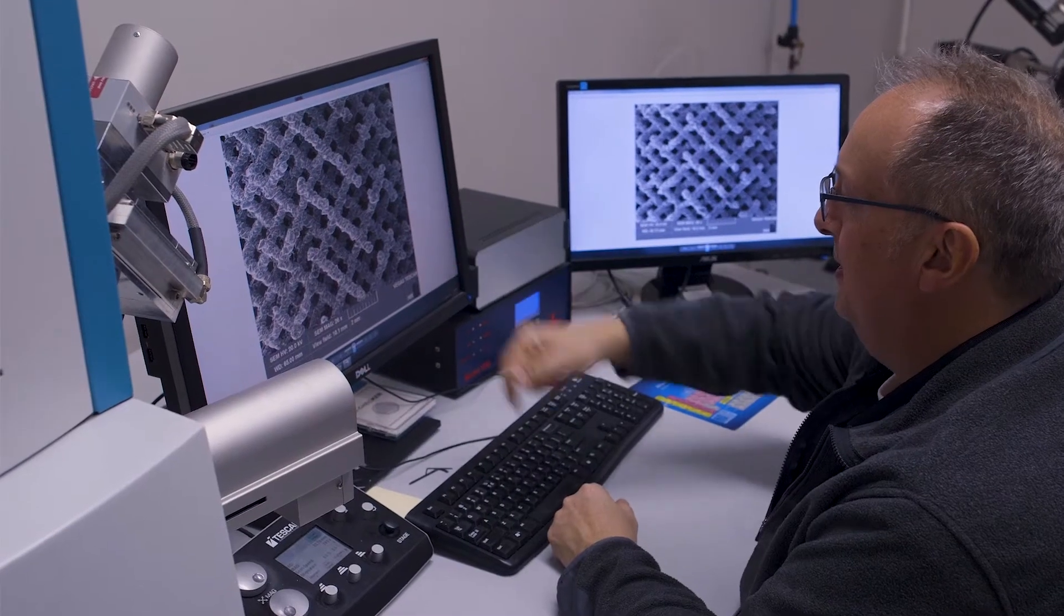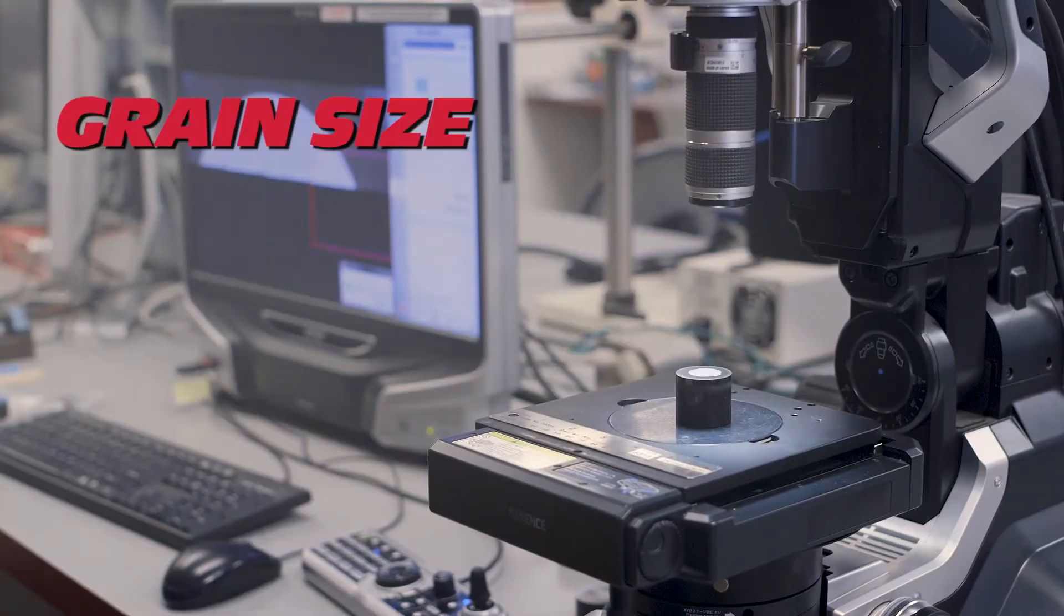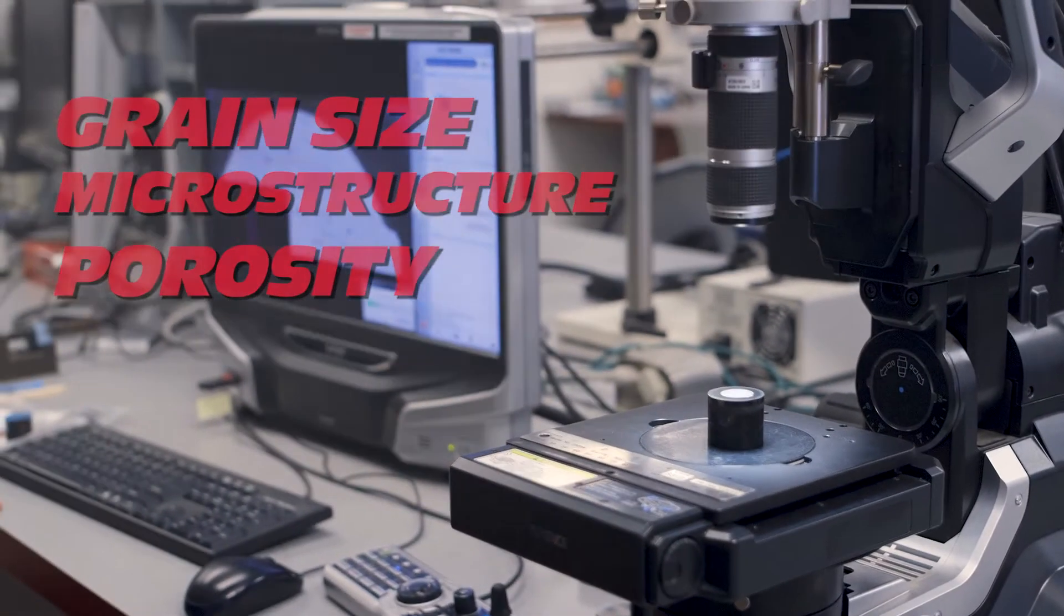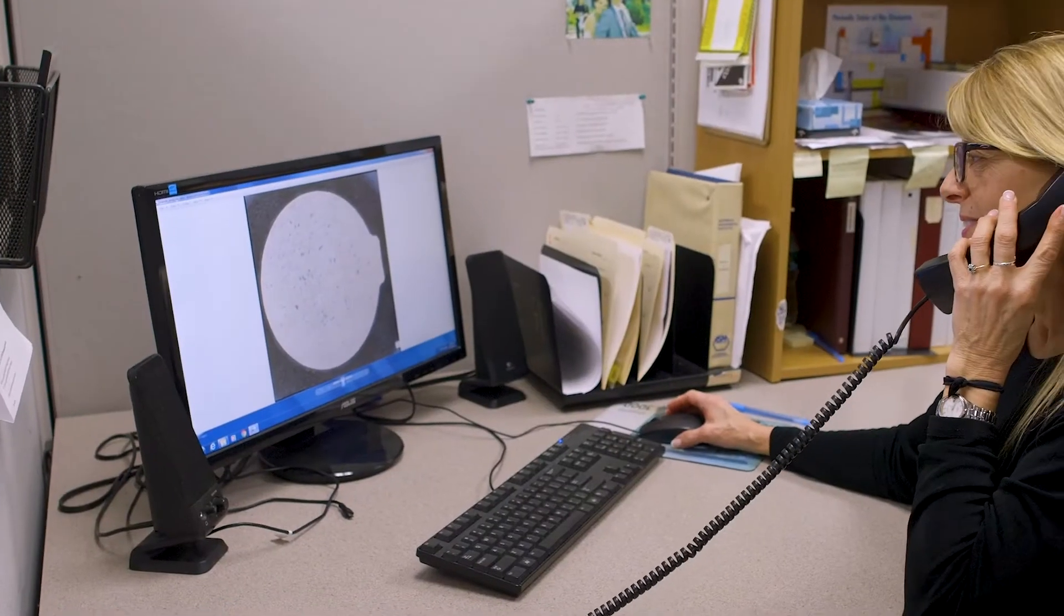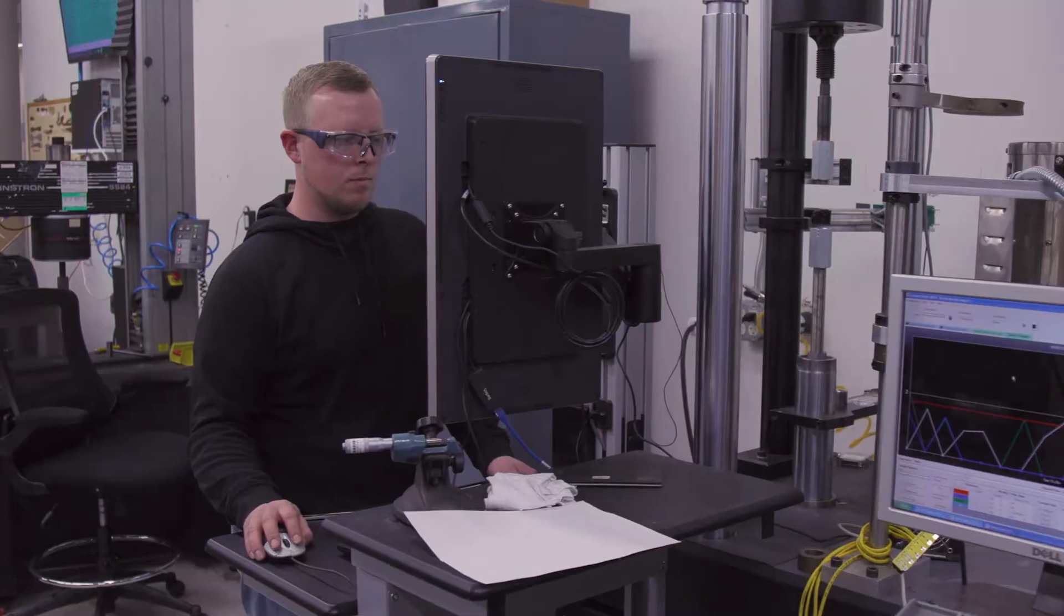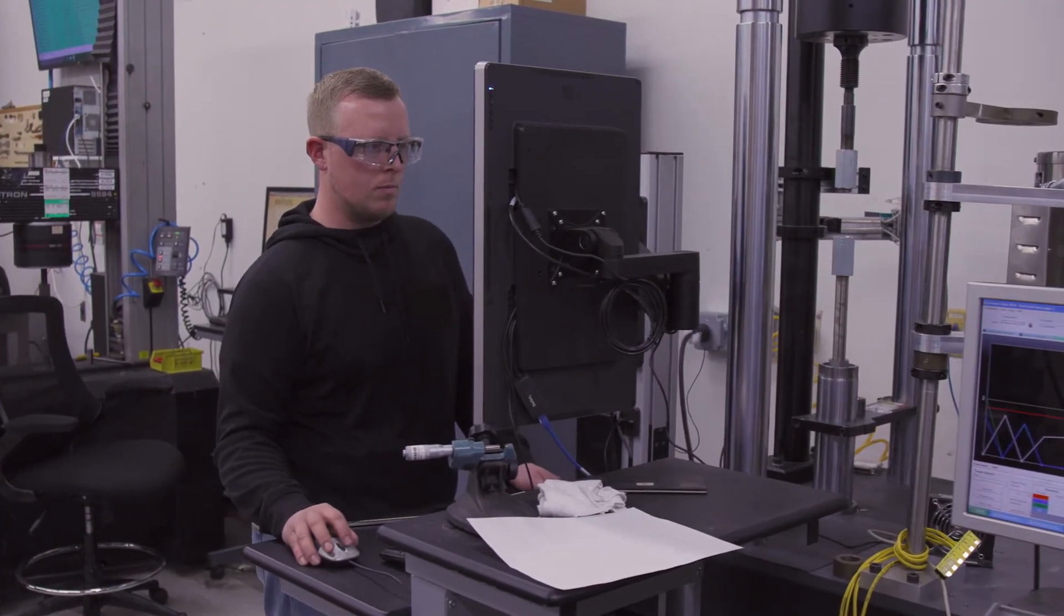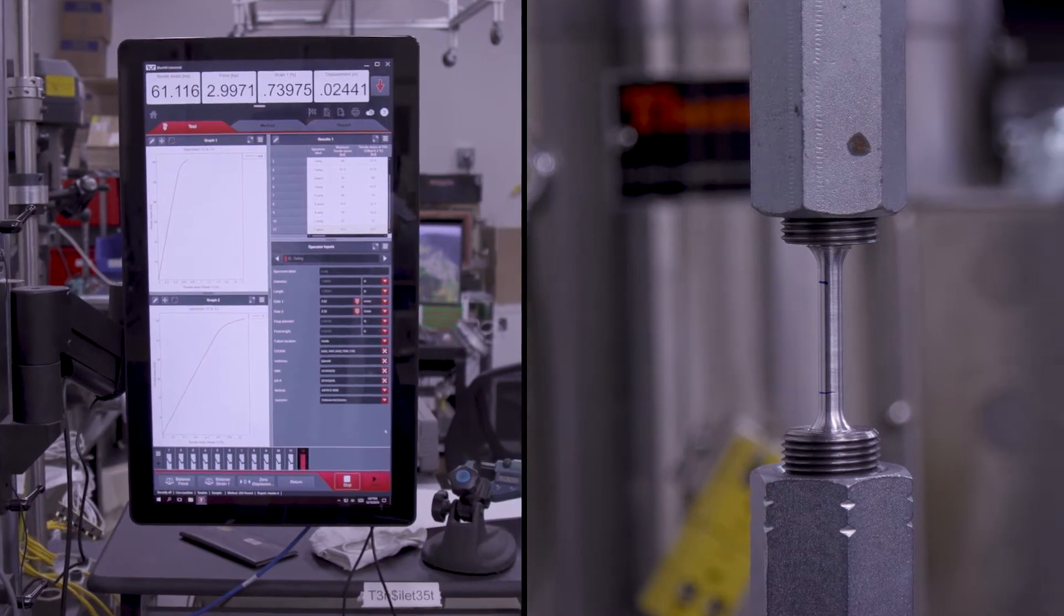Our world-class metallurgists, engineers and lab technicians are experts at determining properties such as grain size, microstructure and porosity, serving to identify any process issues at the microscopic level that could lead to the diminished durability of the finished product. Measuring the mechanical properties of raw materials and components helps provide insight into how they will perform in the final application.